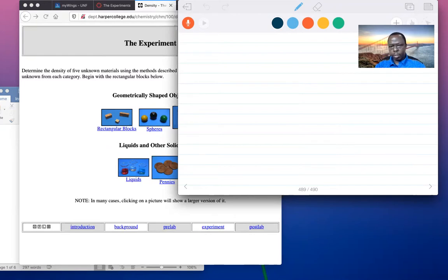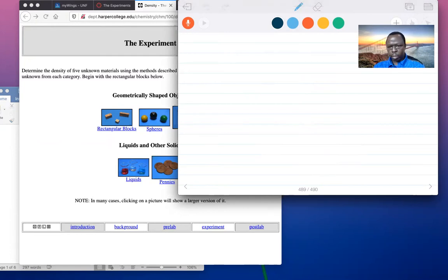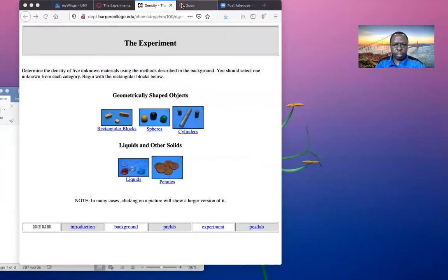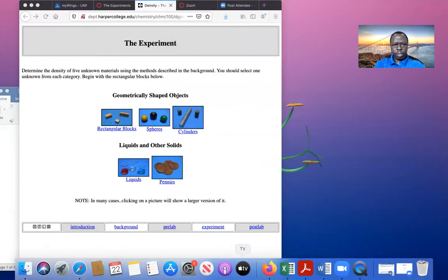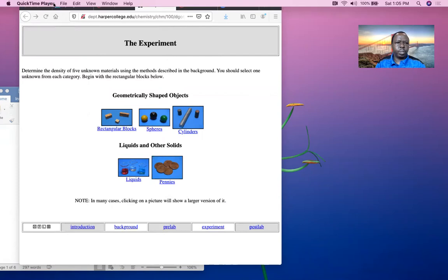It turns out that, oh, sorry, I can't see for some reason, I don't know why, I don't see my whiteboard. On the whiteboard here, you should see. I need to make sure that you are able to see. Hold on, excuse me. So what I'll do is I check this and reconnect. Make sure you can see.